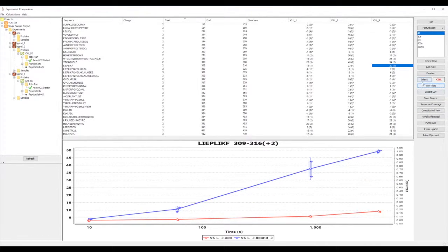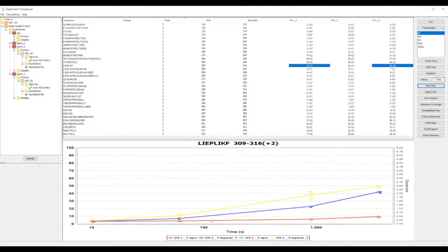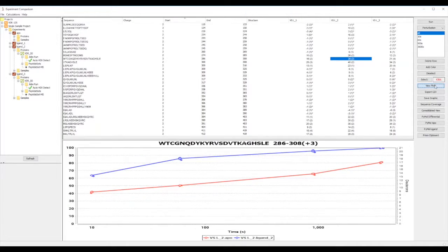The usual zoom in, zoom out graphic export features are available. Deuterons on the right side. One could select two separate cells, visualize the plots. So there is some flexibility here.